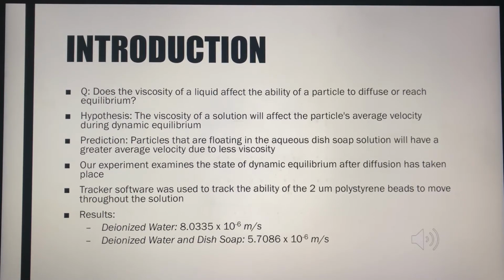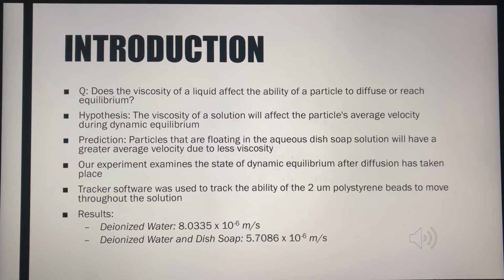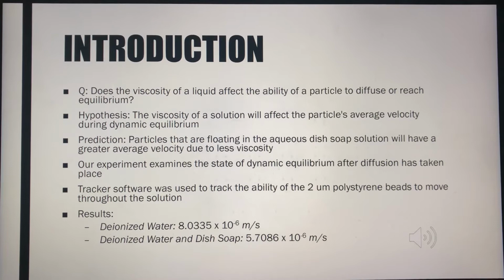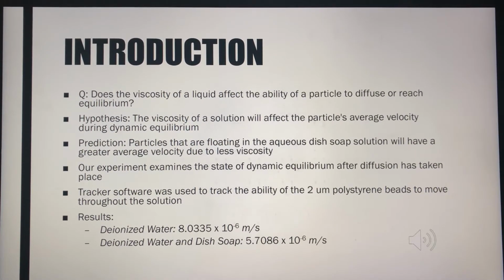Our hypothesis is the viscosity of a solution will affect the particle's average velocity during dynamic equilibrium. Our prediction, particles that are floating in the aqueous dish solution will have a greater average velocity due to less viscosity. Our experiment examines the state of dynamic equilibrium after diffusion has taken place.